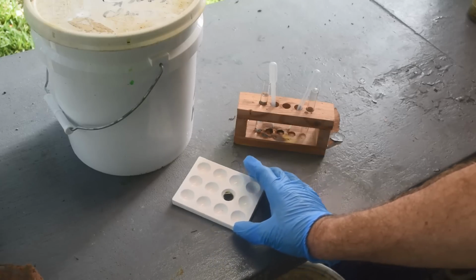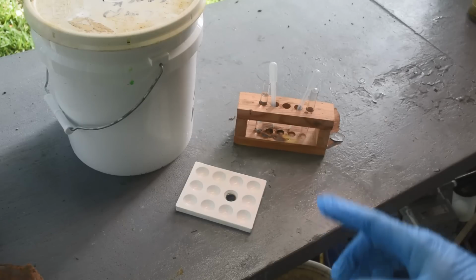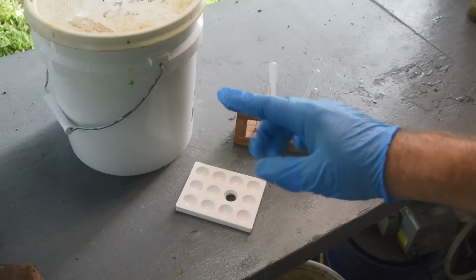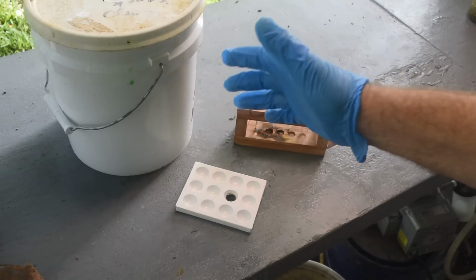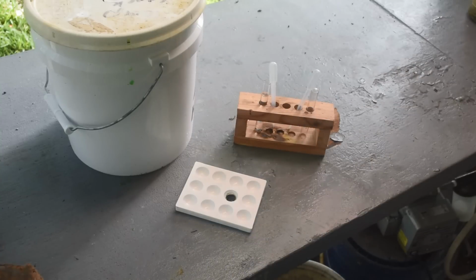So it looks like we've got some gold in this waste liquid. So, hey, bonus. Thank you, Jobin. We got some gold too, as well as the palladium. So I don't think I'm going to tackle the gold in this right now. In fact, I may not tackle the gold at all. I may just put this stuff in my temporary stock pot, throw some SMB in there, and call it a day and let it settle out to the bottom of the temporary stock pot.